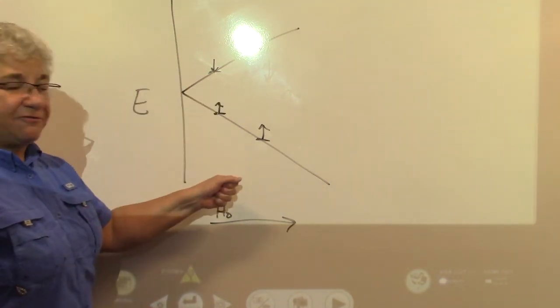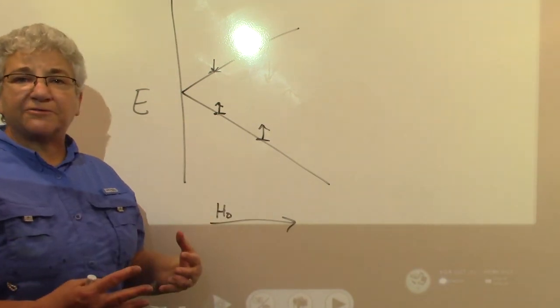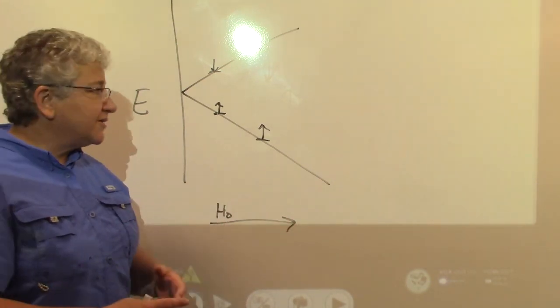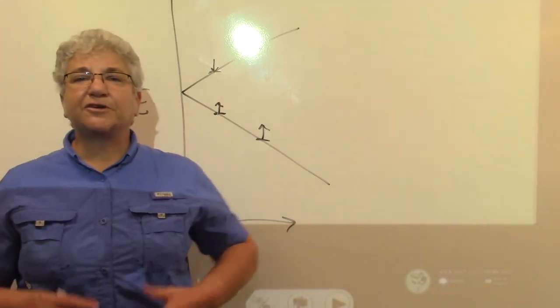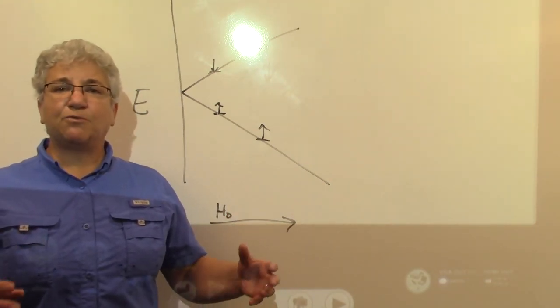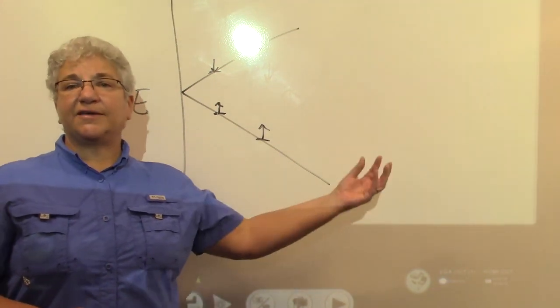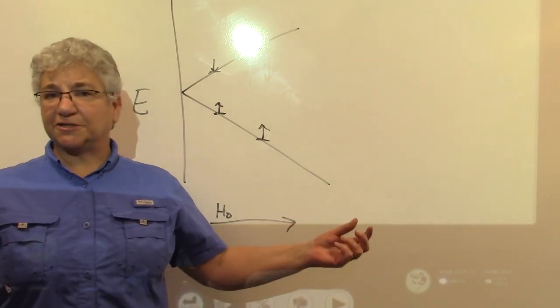Now I have my sample in the field. This exists. But the way I get a spectrum is that I flash energy at this sample through those wires, and the energy that I'm using is simply radio-generated frequencies. So this is where you have to go back to Gen Chem a little bit and think about your electromagnetic spectrum. What type of energy, what type of waves, what type of radiation has the highest energy? Who remembers their electromagnetic frequency spectrum?